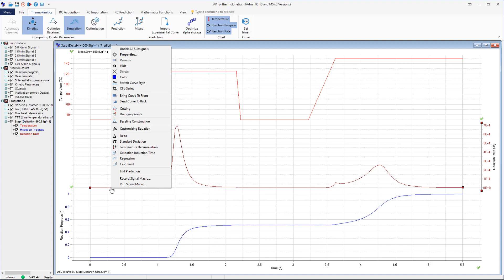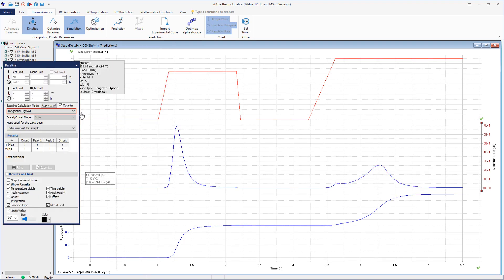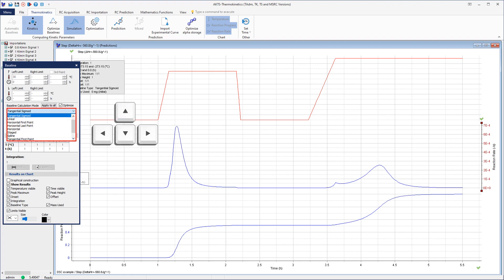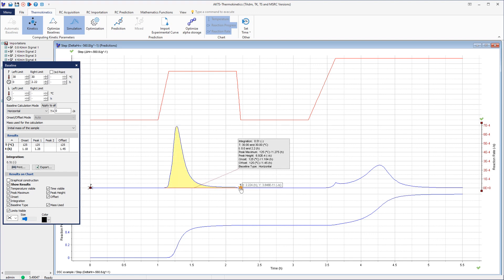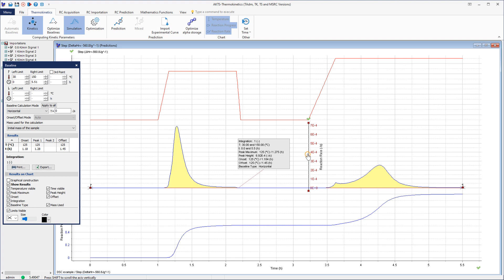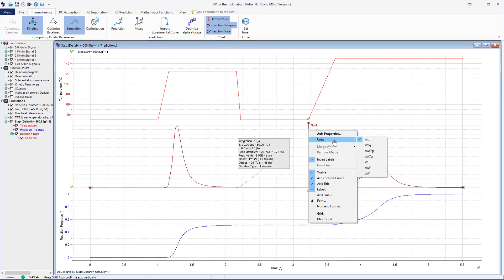After clicking on a chosen curve, the window containing possible actions is displayed. The action of Baseline Construction is chosen. Selection of baseline parameters in the displayed window, including selection of the baseline type. Input of the left and right temperature limits used for the construction of the baseline. After clicking on a chosen axis, the window allowing the change of the axis properties is displayed.